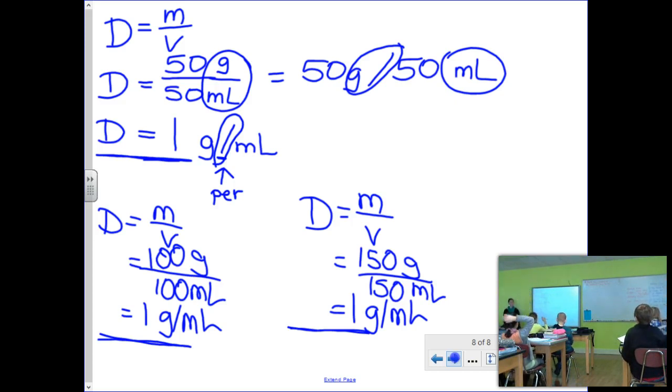Gage? All the densities are the same. Does that not freak anybody else out? I just think that's weird. All of my answers are 1. Now look at your densities. You should have seen, and a lot of you came up with, that this is the relationship. Were all of your densities close to being the same number? Raise your hand if all of your densities would have rounded to 1. If you had 0.9 anything, your answer would have rounded to 1.